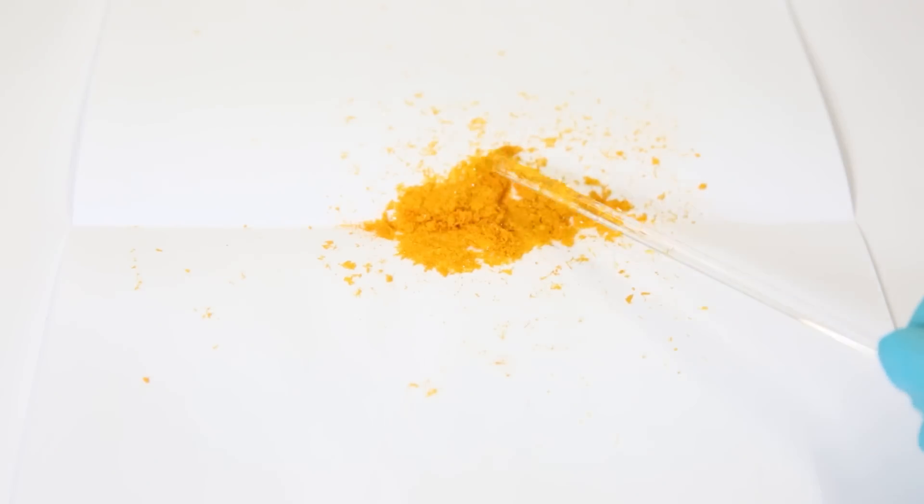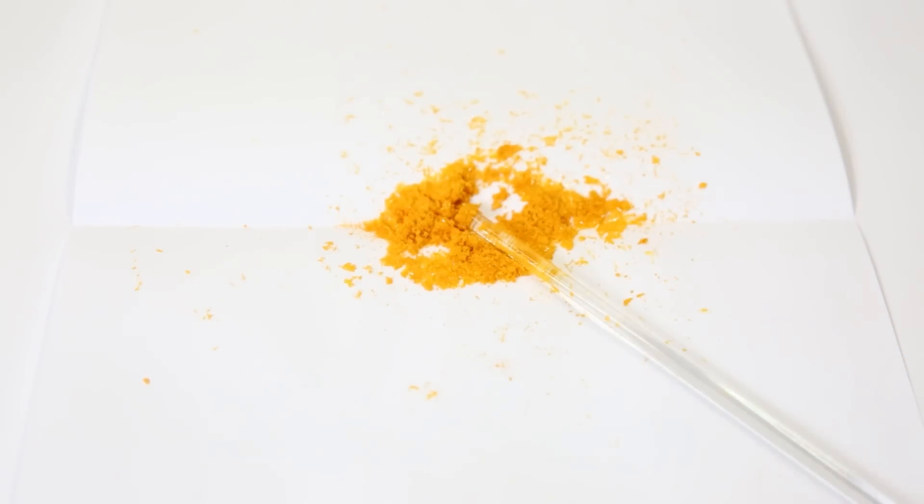Now with this ferrocene, I want to try a reaction. I want to make ferrocenium tetrafluoroborate, which is a blue complex. Ferrocene can be oxidized to the cation ferrocenium and then complex with tetrafluoroborate. To try this out, I will do it in a simple way without exact amounts.